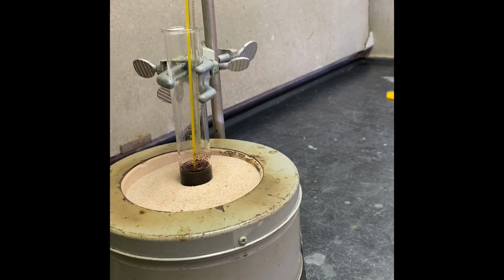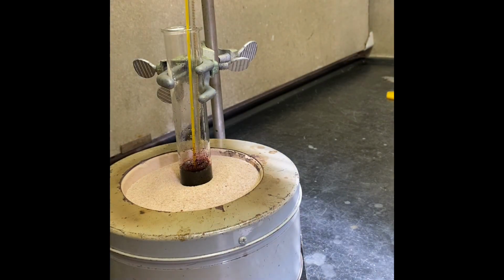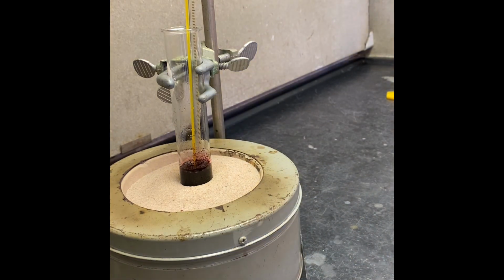We will boil our reaction mixture, which the boiling point gonna be around 185, and during that time reaction is gonna happen and the color gonna be changed, so we're gonna follow that and we're gonna wait till no further color change. When we're gonna reach that point, we're gonna stop our reaction. So now as you see it start to boil.